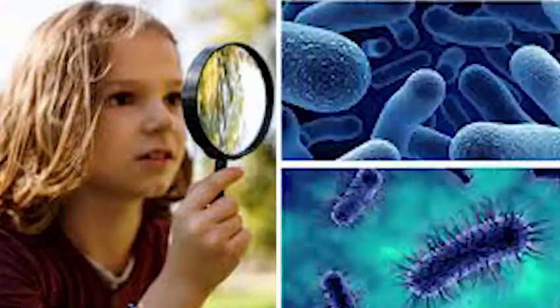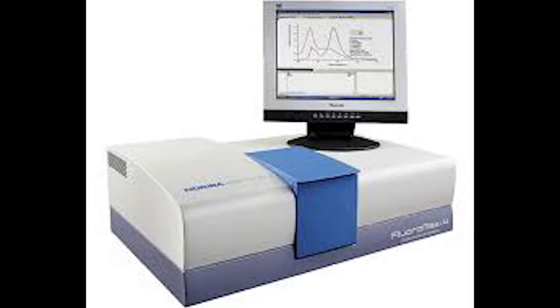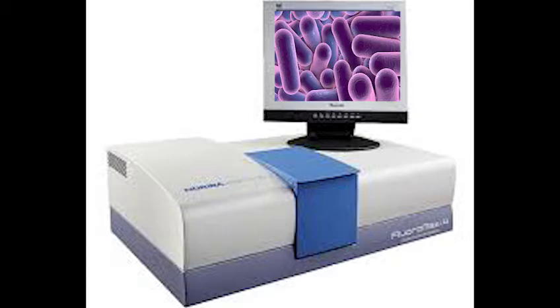Currently, almost every procedure available to diagnose microorganisms has some barriers that should be overcome. But studies state that fluorescence spectroscopy has already overcome some of the limitations, and in the future, this technique has the potential to be improved. For example, by integrating optic fiber, this instrument can be used to diagnose microorganisms in vivo. Besides, another future improvement is the automatization of these instruments, which makes it possible to analyze many samples at one time.